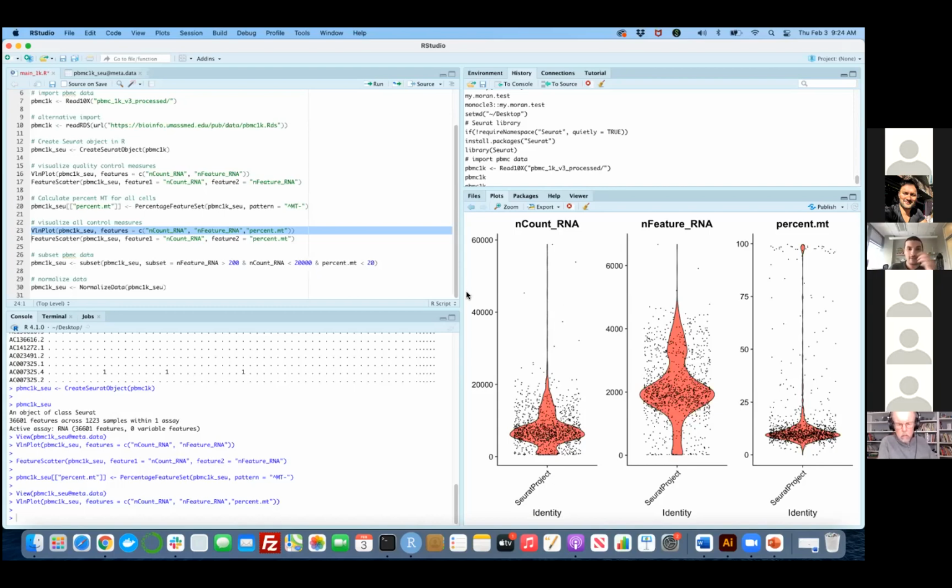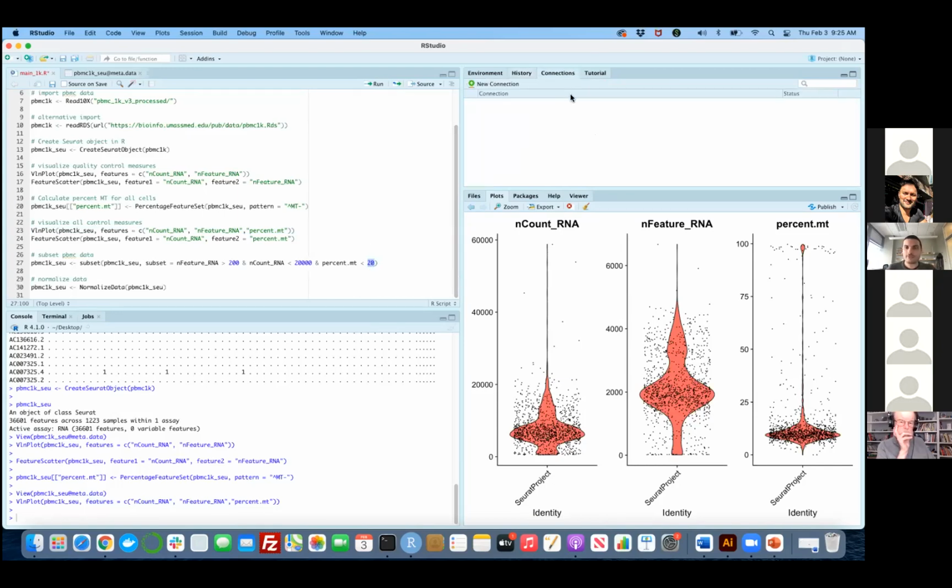Yeah, well, here's the thing. In single cell analysis, there is no best answer. It is always possible that by removing those that are higher than 20, you may be losing some cells that are of some importance. Maybe we can try Alicia's option as well. And Kashi also asked me something, I believe, whether we have to remove them.